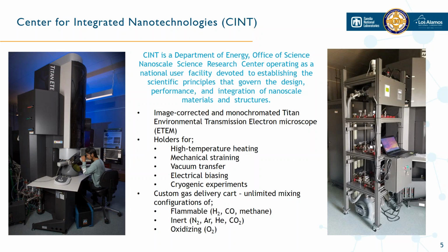So we had many holders for in-situ analysis that are compatible with the microscope for high temperature heating, straining, vacuum transfer, electrical biasing, as well as cryogenic temperatures. And then of course, being an ETEM, we have a gas cart for delivering gases into the pole piece of the microscope. So let's go to the next slide.